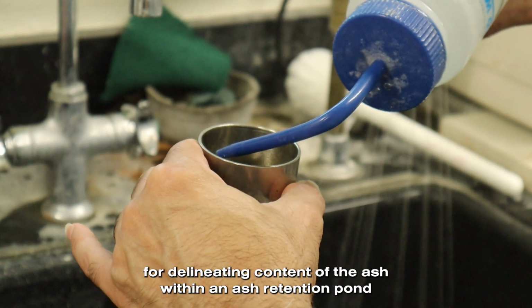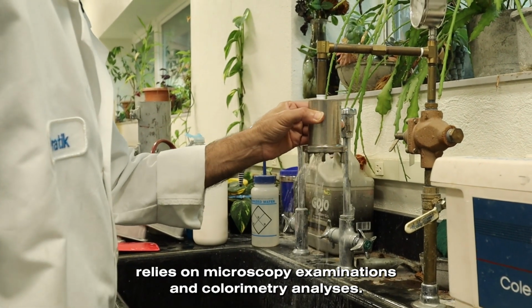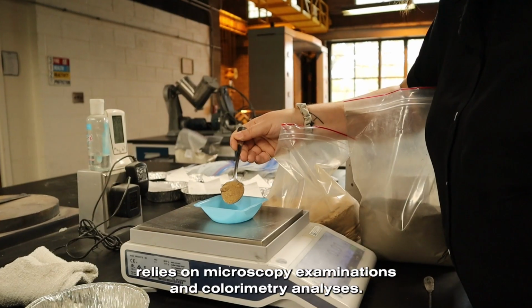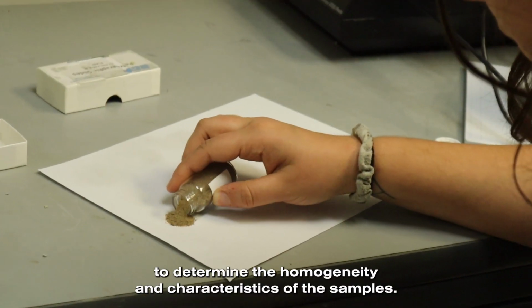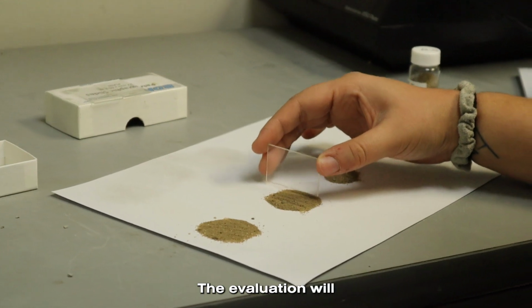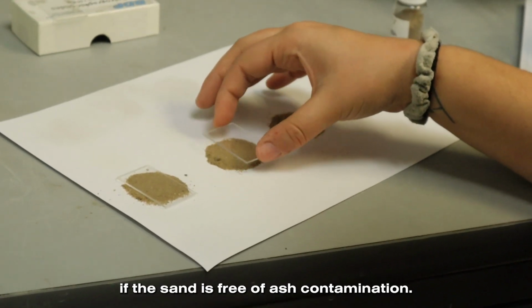The test method for delineating content of the ash within an ash retention pond relies on microscopy examinations and colorimetry analyses. Ash and clean sand samples from the pond are initially evaluated microscopically to determine the homogeneity and characteristics of the samples. The evaluation will reveal if the sand is free of ash contamination.